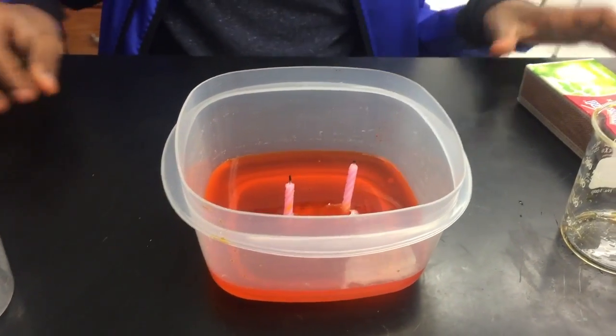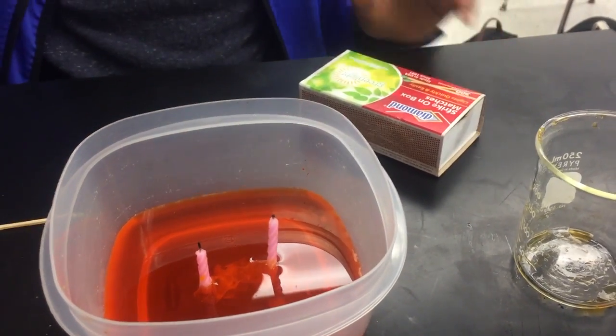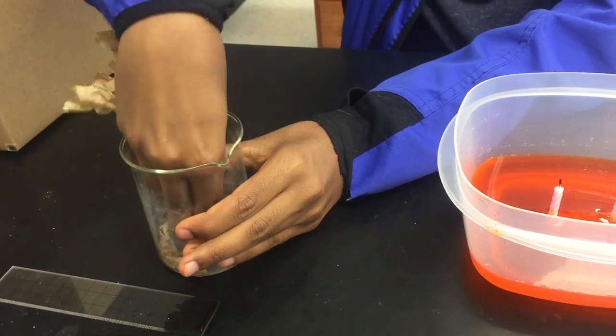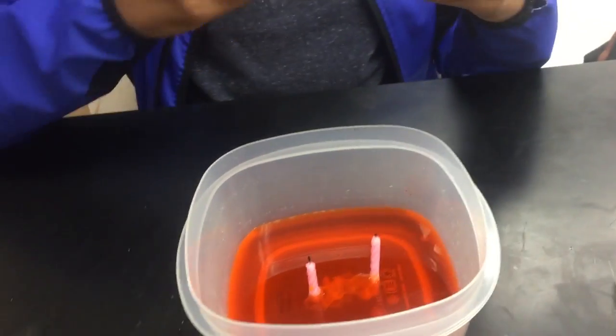So for the second trial, we're going to be lighting both the candles to see how much water is going to rise, and make sure to dry off the beaker just to make sure that both trials are taking place under similar conditions. Okay. So I'm going to light both candles now.